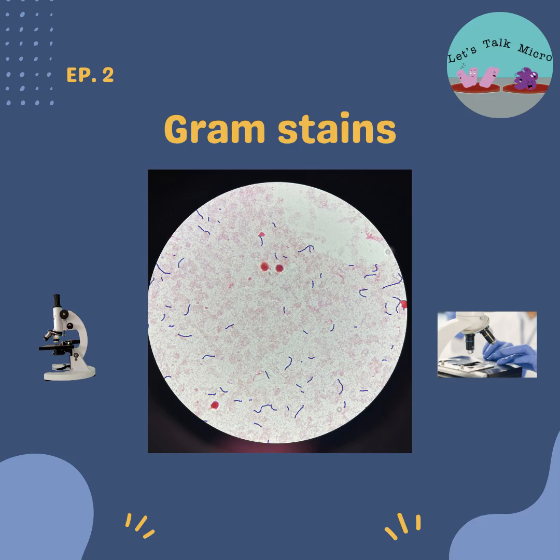So that's the first thing you're thinking about with gram stains. We hear these terms, gram positive, gram negative. So why are they gram positive? Why are they gram negative? It comes down to their cell wall composition. A thicker wall grabs that first dye and holds on to it. With a thinner wall, the dye goes out. You end up keeping your last stain, which is the safranin, and that is pink.